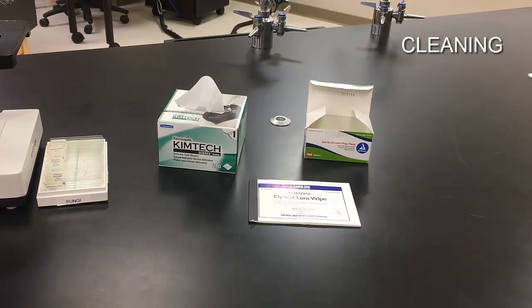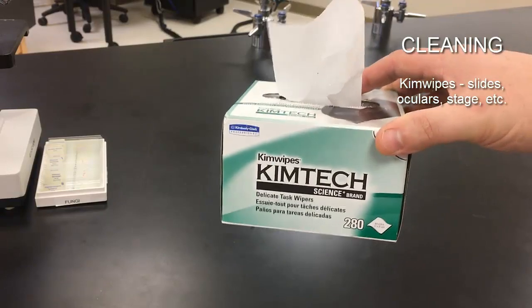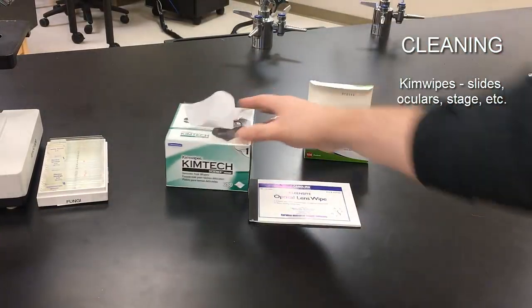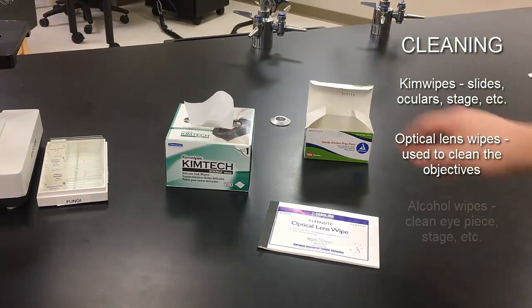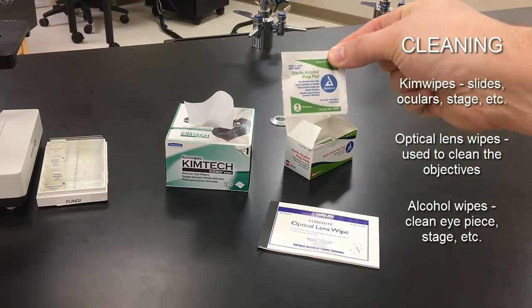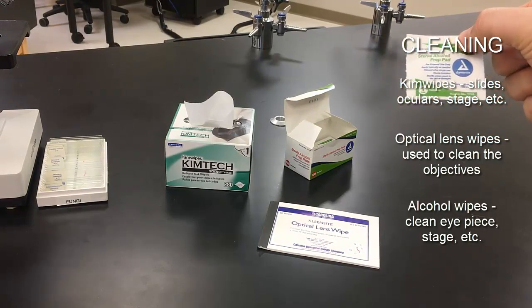Before using the microscope, you may want to clean it. We have a couple of different cleaning materials. Kim Wipes or Kim Tech Wipes are good for cleaning eyepieces. Optical lens wipes are really good for wiping down the objectives, especially for fine cleaning. Sterile alcohol prep pads are good for wiping down the eyepieces so you don't share germs from the previous user of any part of the microscope.